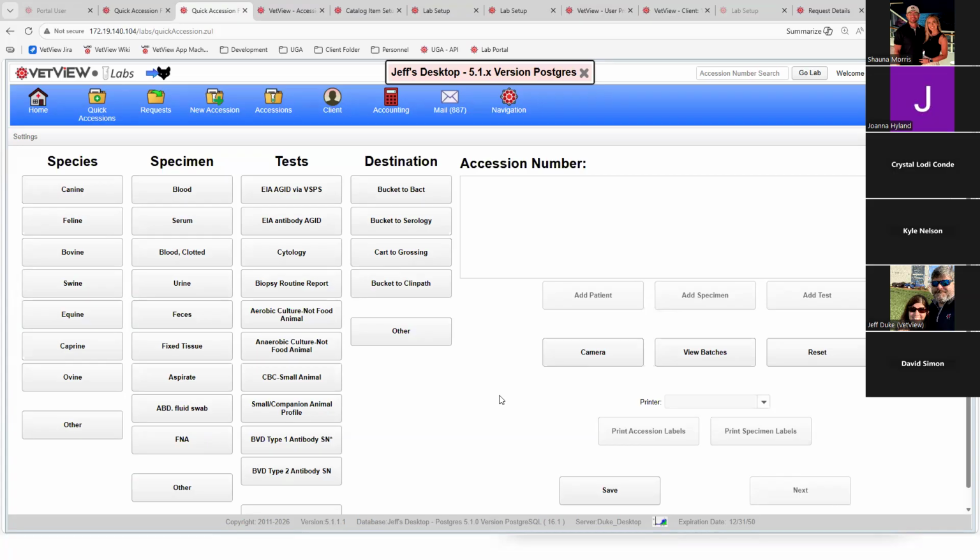That's the concept between the dirty area and the clean area. In the dirty area, I want to touch it as minimally as possible, then allow someone sitting at a desk in a clean area to go in and do the paperwork later, while also getting the lab documented and labeled and into processing quicker. So it's just another option there.